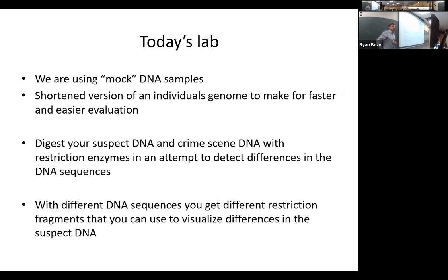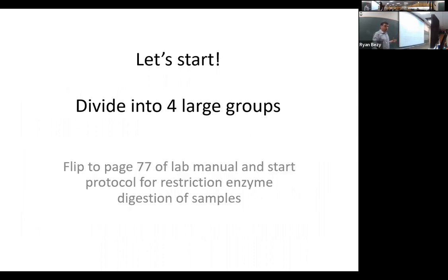Okay, so what are we going to be doing today? We're going to be using some mock DNA samples. These are shortened versions of an individual's genome. I'm not going to have you isolate DNA from yourselves or other people. I've got some easier fragments to work with, to make it a little faster. We're going to digest them with those restriction enzymes, and then sort those different possible DNA fragments based upon size, doing something called gel electrophoresis, which I'll talk more about in a second. And then we'll visualize that.